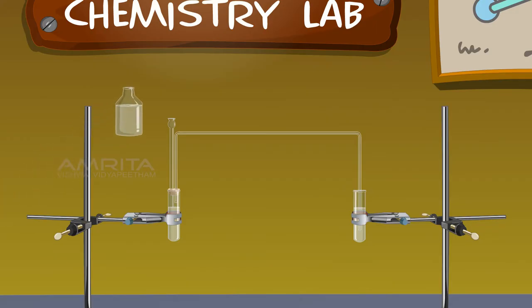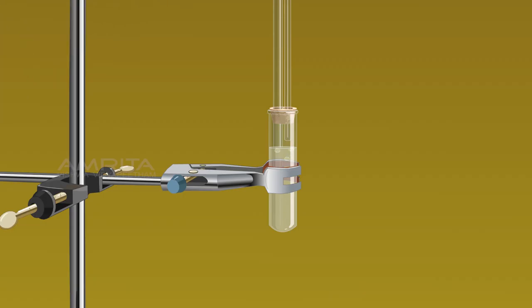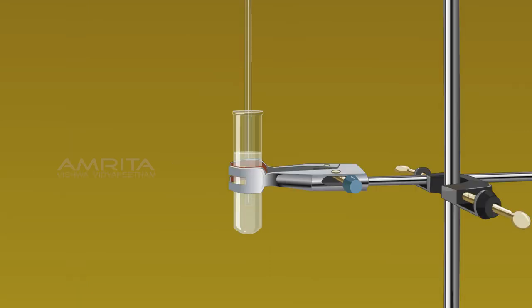Pour the acetic acid through the thistle funnel into the boiling tube containing sodium bicarbonate. A gas evolves. The lime water in the boiling tube turns milky. The gas evolved is CO2 which turns lime water milky.